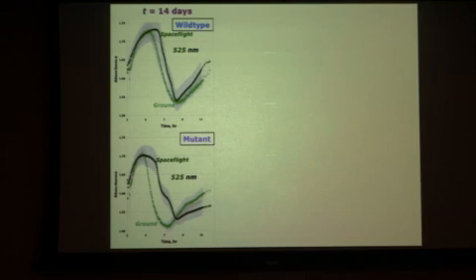It's very characteristic, and you know this isn't some weird temperature effect because, first of all, it does the same thing in space and the ground. Again, the space growth is delayed a little, slower than on the ground, but it basically does the same thing. The mutant looks a little different from the wild type. In this case, the mutant is a radiation-sensitized mutant, so it's more susceptible to space radiation.